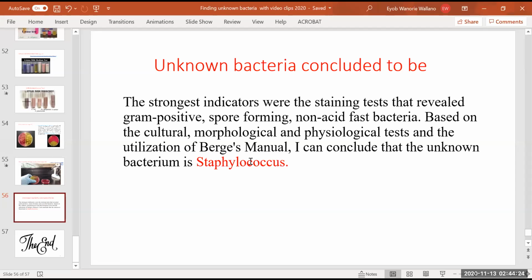So for this reason, you don't need to take somebody's culture. You need to work with your own culture. But in this case, because of the MSA agar and the catalase test, the student has a Staphylococcus. Now, the student is going to conclude. For example, Dr. Asi wants a two-page explanation. I don't need it. I want only the short answer, and then finish the activity. Five pages, what they have done, plus they need to give me the conclusion.